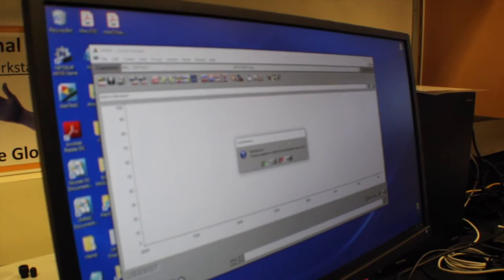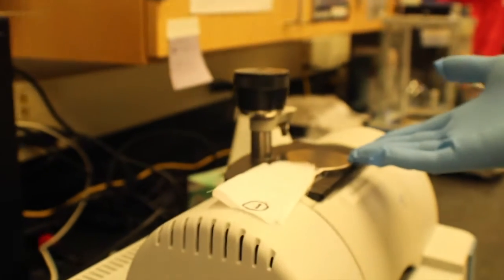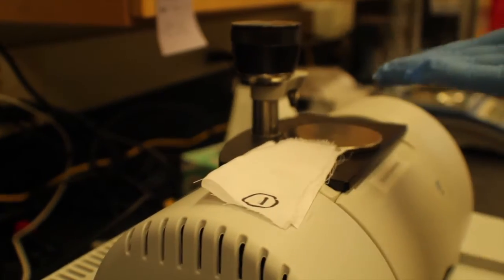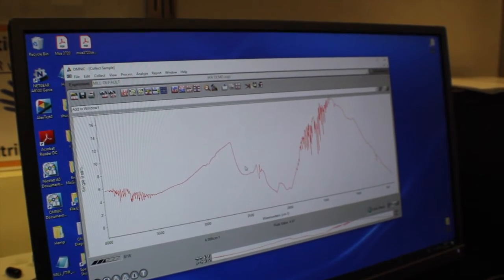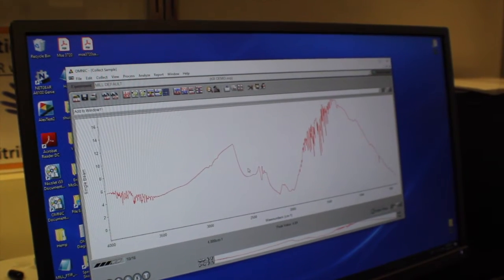In order to have proper results, we need our FTIR to take in a background of everything going on in the lab so it can provide clearer results. So we're going to let it run without a sample present. We have our FTIR picking up background in this position, and we'll let the machine run. At the bottom, the progress bar tells us how close we are to finishing, and we can see the different wave numbers for our background counts, which will set a basis and help us discriminate the sample we're actually looking at.